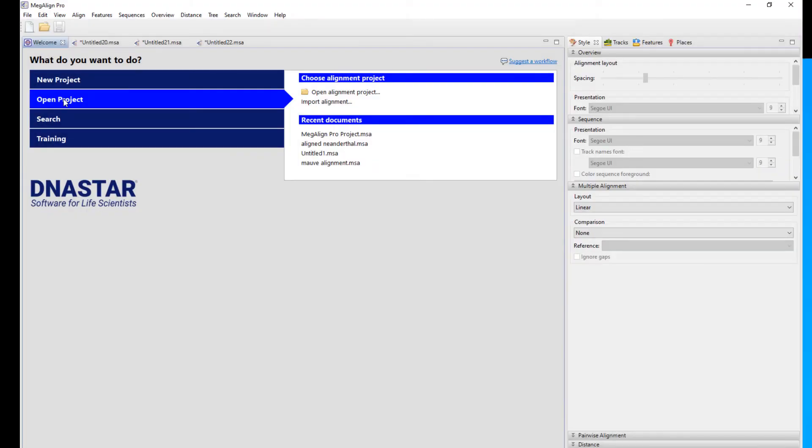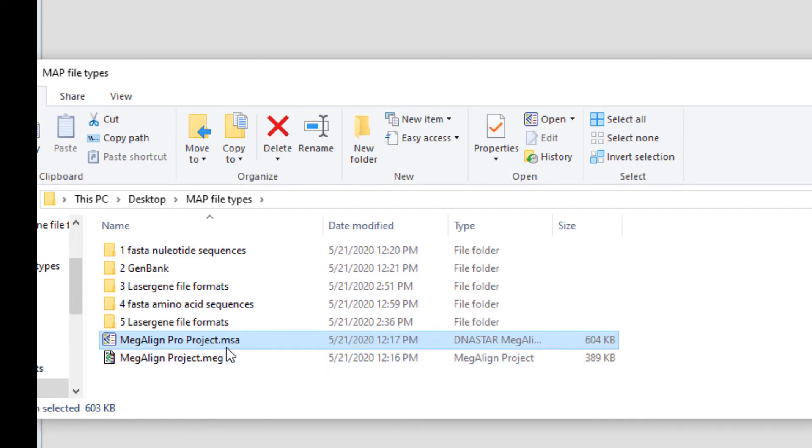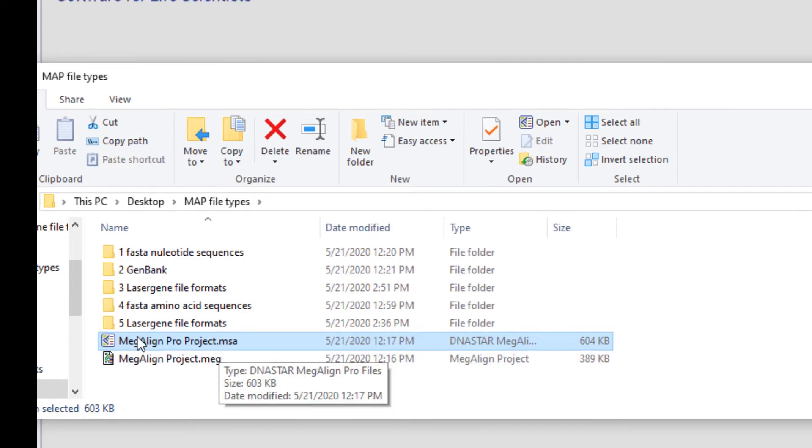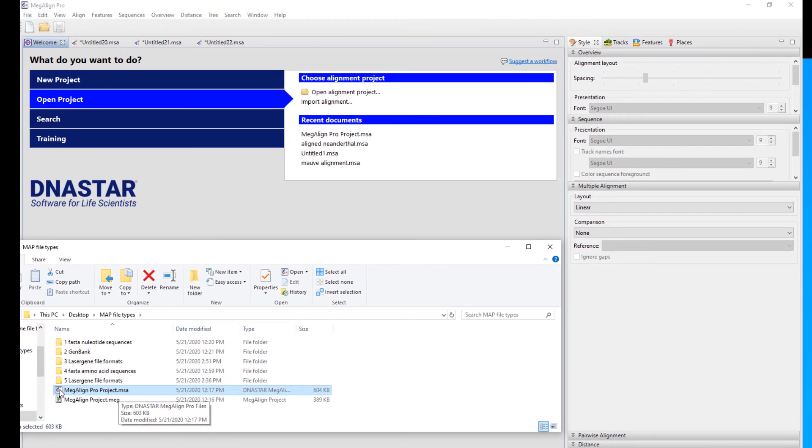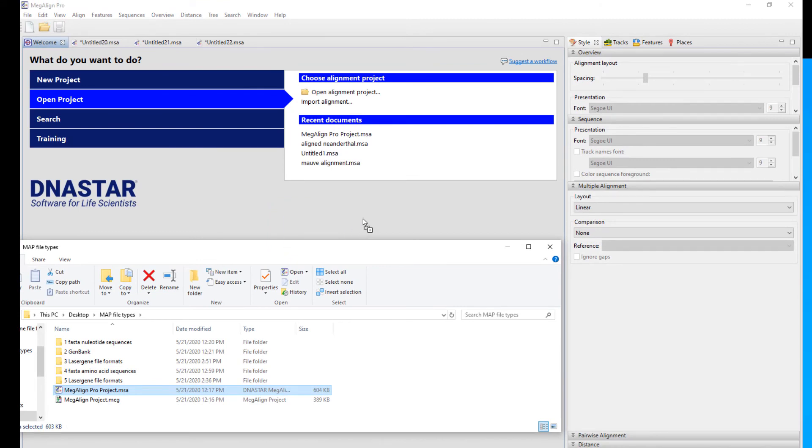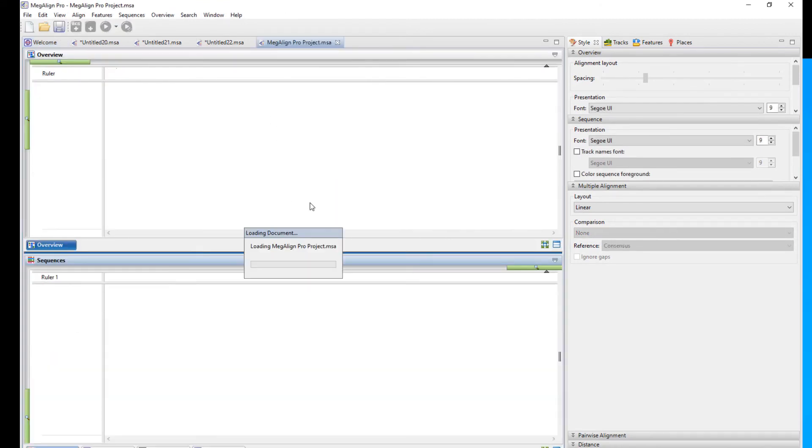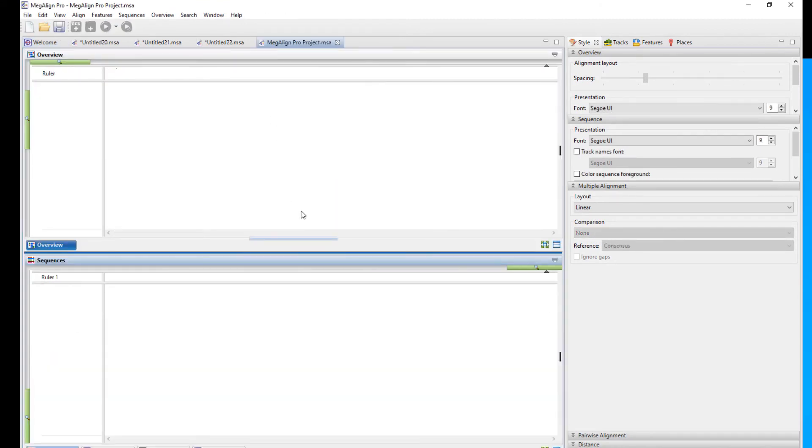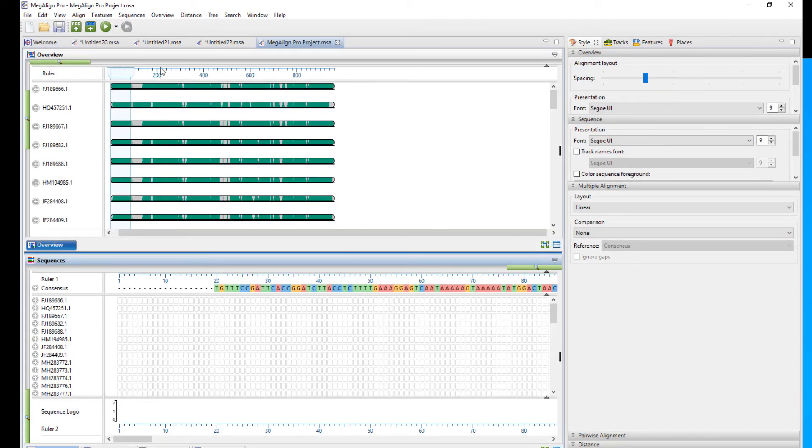There's two other options I wanted to demonstrate. This is if you are starting with a pre-existing project. This is the Megaline Pro application. It's able to accept Megaline Pro projects. And Megaline Pro projects will have a .msa extension. And these can once again, either be drag dropped right onto the welcome page and launch that way.